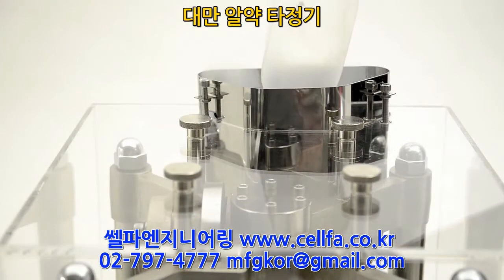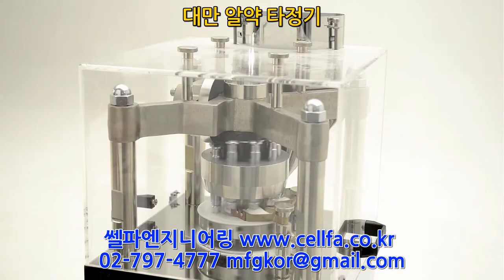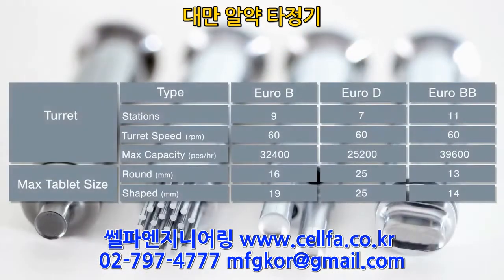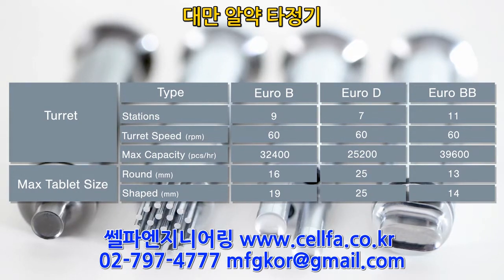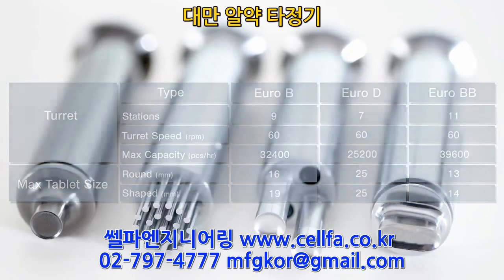The RTP-118 can be supplied with a 9-station Euro-B turret, 7-station Euro-D, or an 11-station Euro-BB turret, which not only makes tooling easily accessible, but it can also hold both round and key tooling, allowing you to produce tablets to suit your customers' needs.